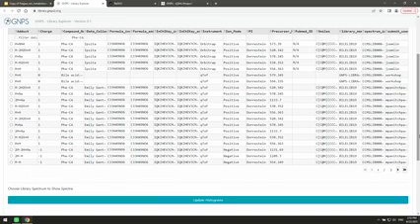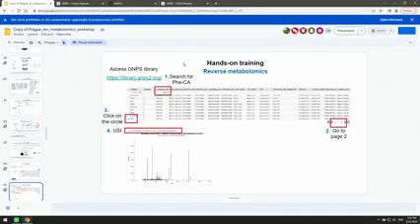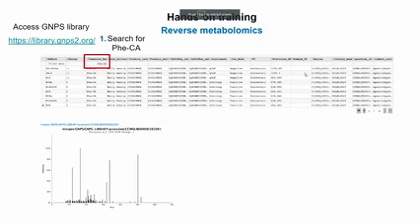Who got already the phenylalanine cholic acid? Okay, so most people got it. So you basically need to go to this compound, and then you need to filter the phenyl. Yeah, so you just type. Use the slides. You could just go to the slides from that URL as well. Just follow the slides.